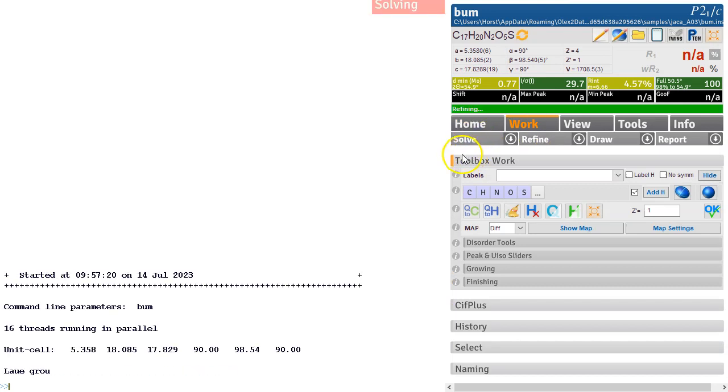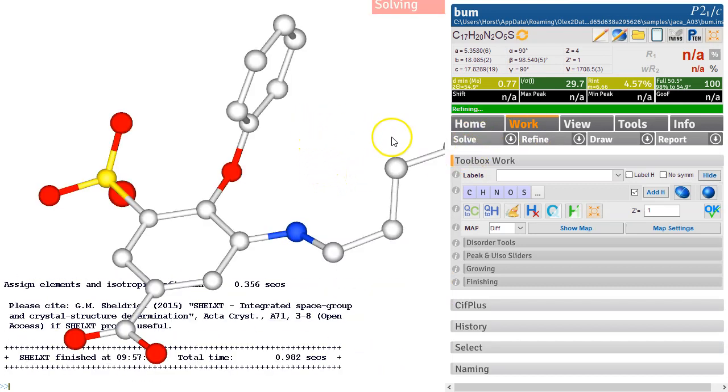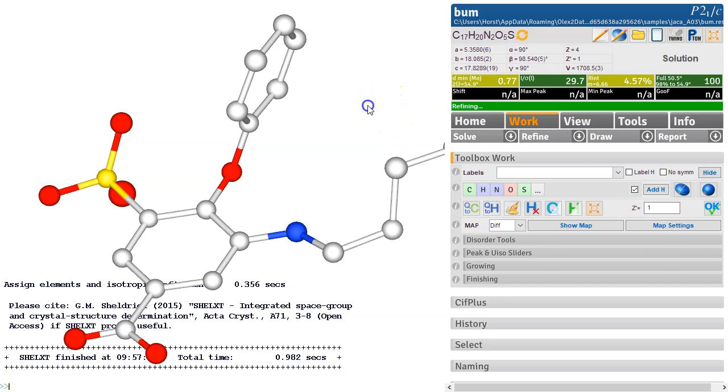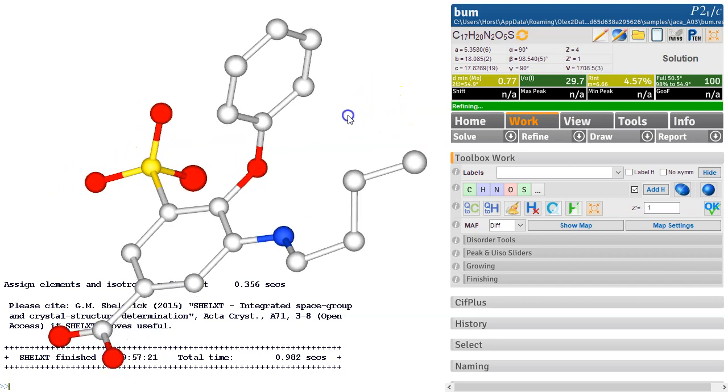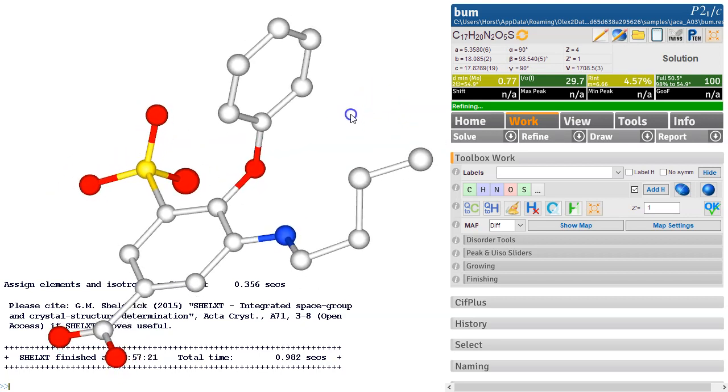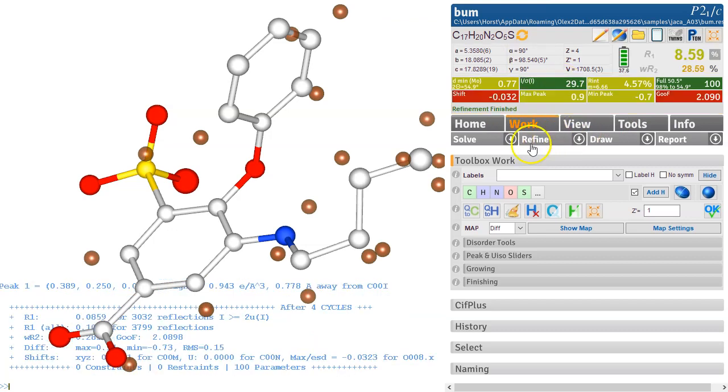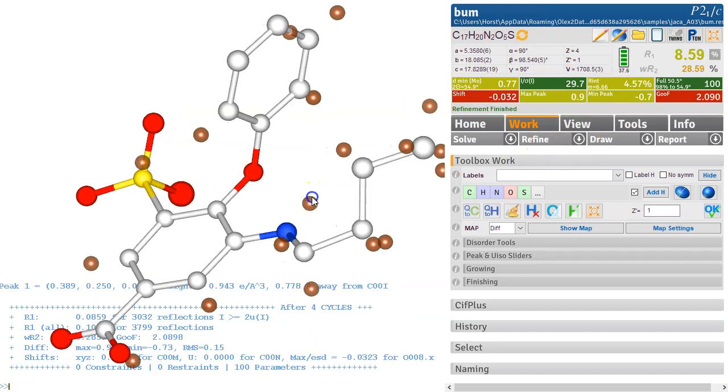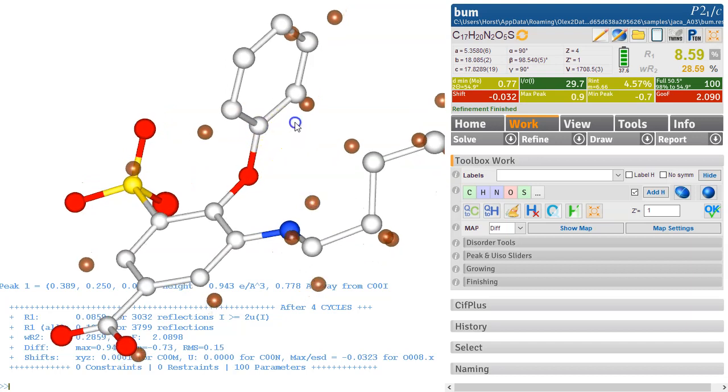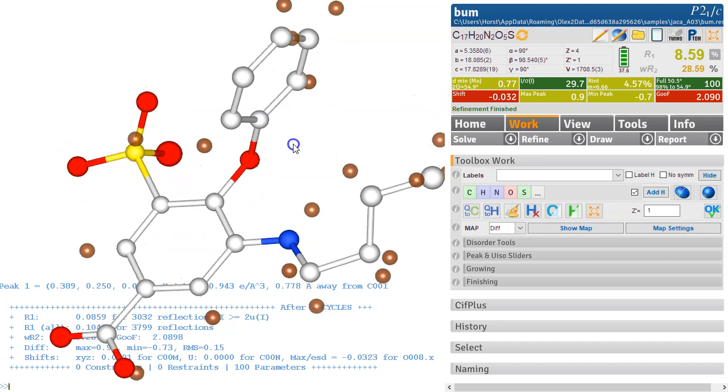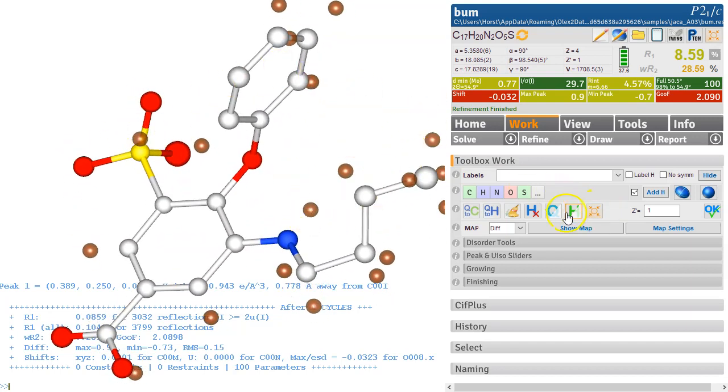I'm going to use ShellXT and it solves the structure pretty much straightforward. All the atoms have been found and atom types have been assigned. The first thing, type refine to see what happens, and we can also press that button of course. This all looks pretty good and we can already see all the hydrogen positions here. So all these Q peaks here, we can press them up, Control M.